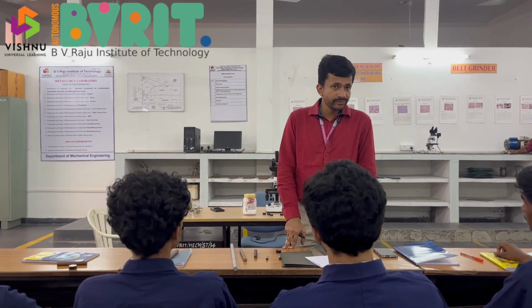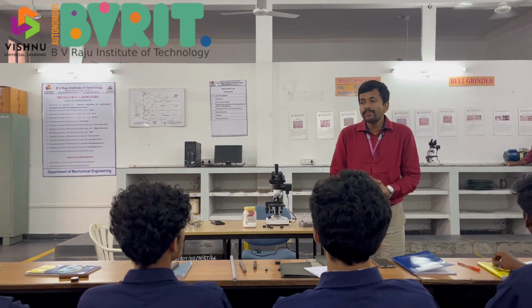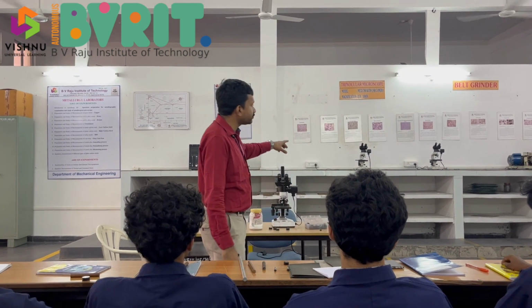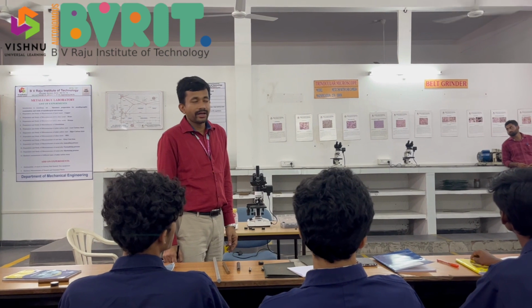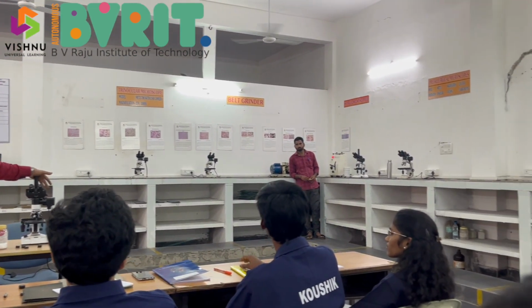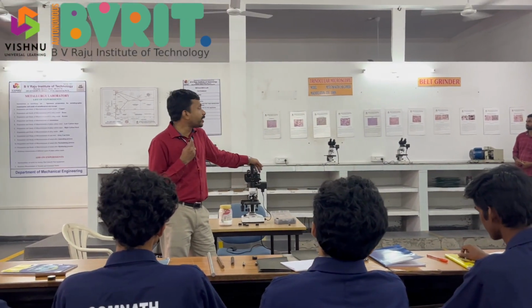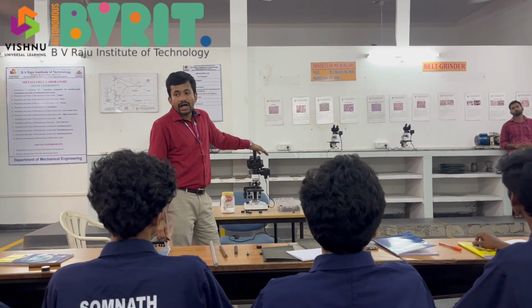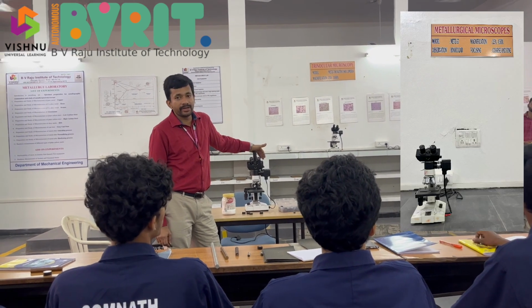Clear? So finally, to conclude, in this lab, what do we have? Now if you observe altogether, how many microscopes are there? 5 microscopes. Okay, you have 5 microscopes. Among the 5 microscopes, 2 are trinocular and 3 are binocular microscopes.